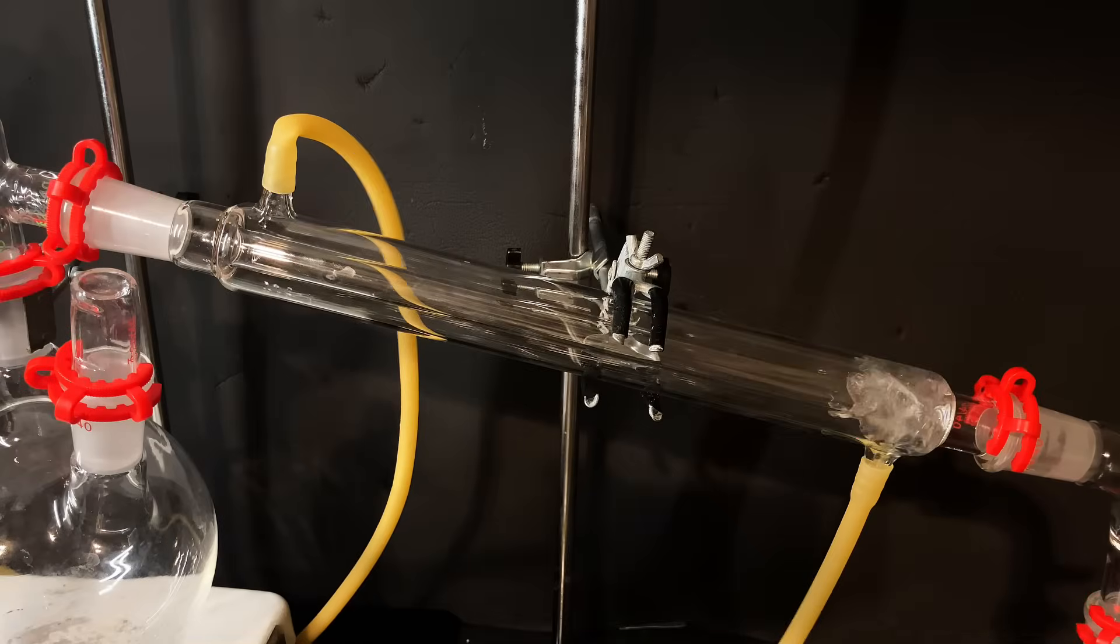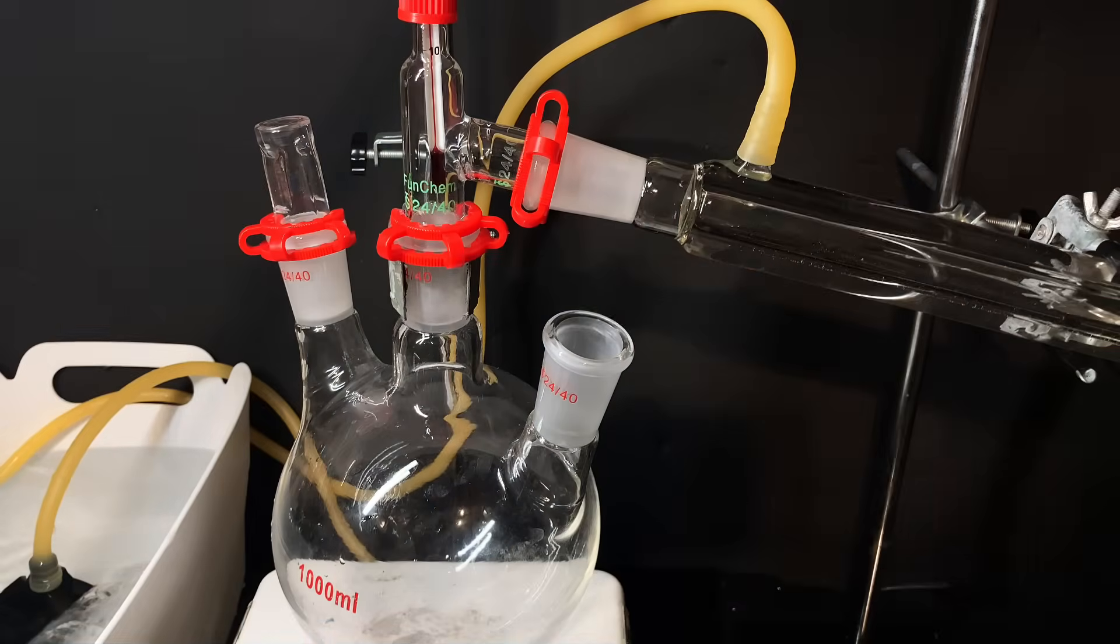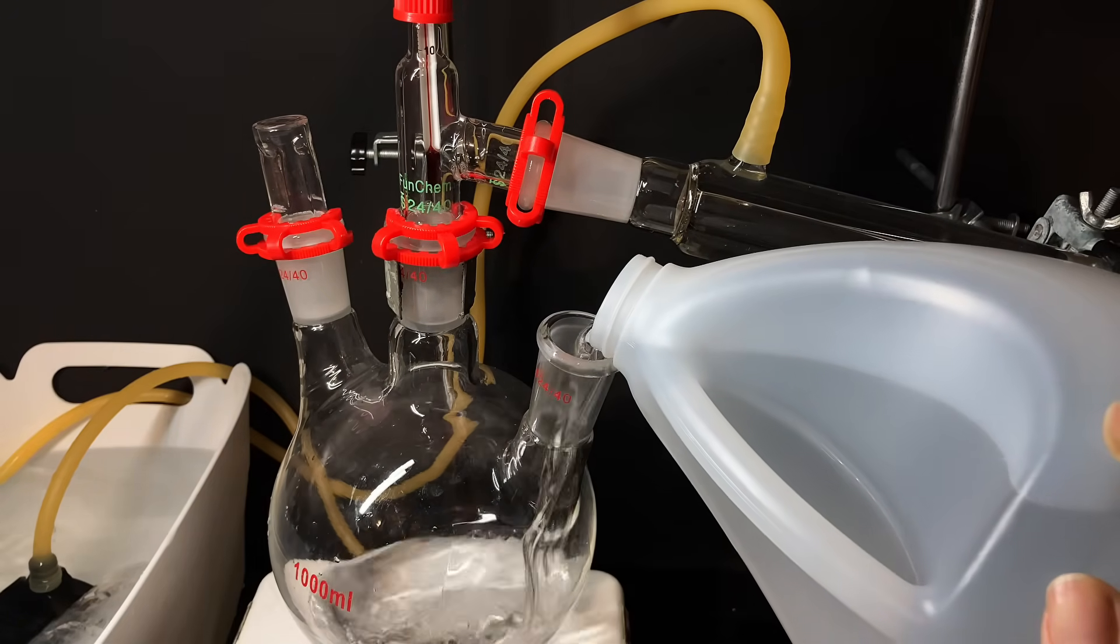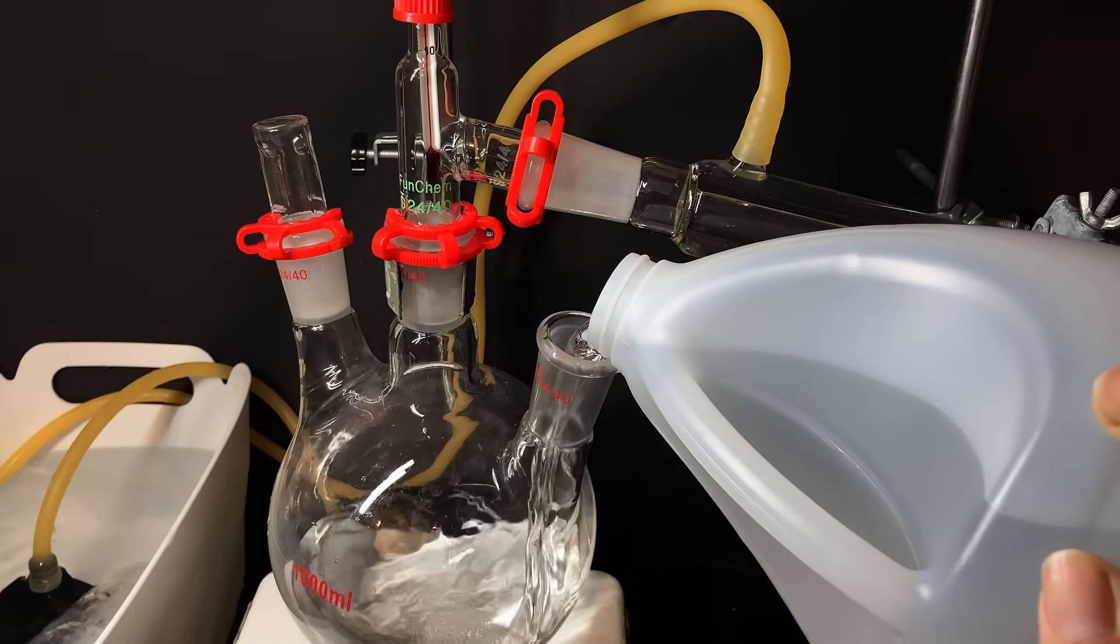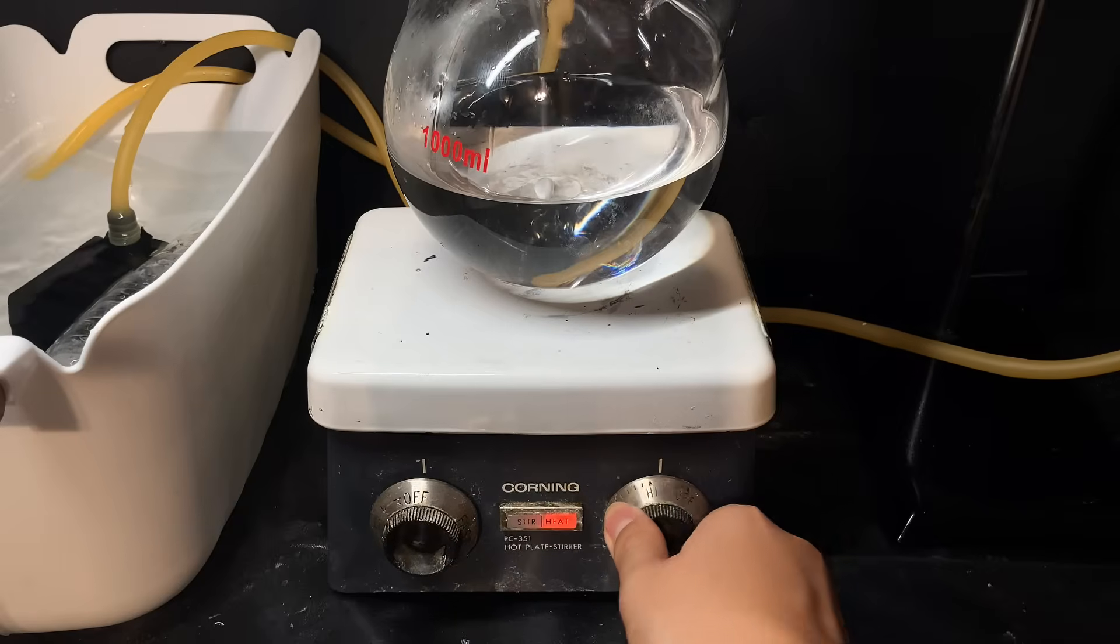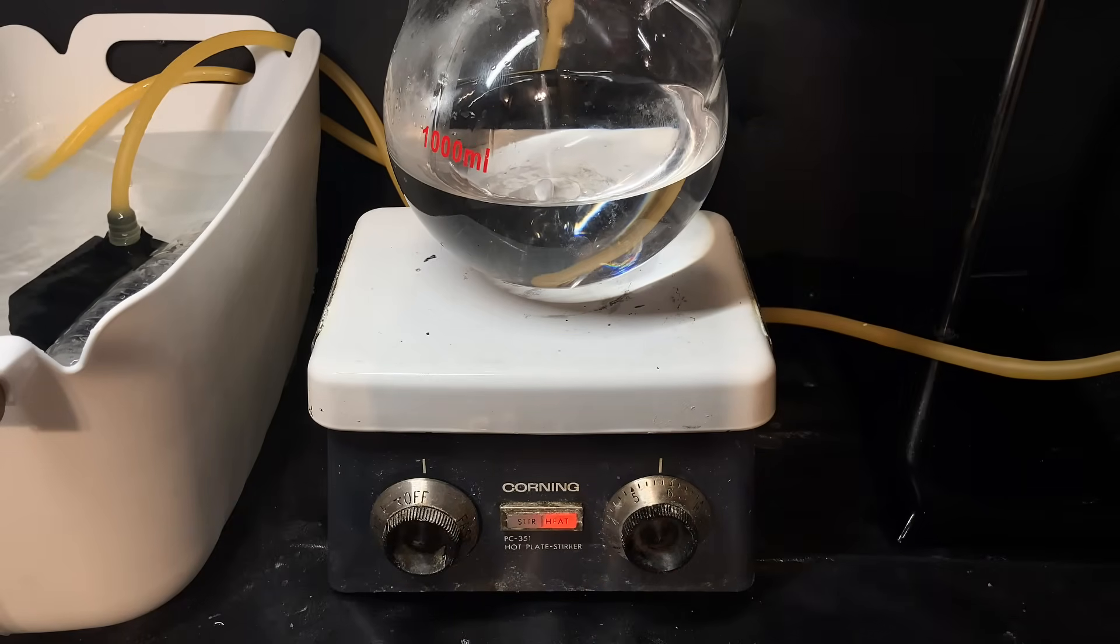I cracked open the jug and poured about 500 mils of the sanitizer into the 1 liter round bottom flask. You don't want to fill it up too much, usually not past half. When I felt it was all good, I dropped a stir bar into my flask and cranked up the heat to the highest setting to get the boiling started.